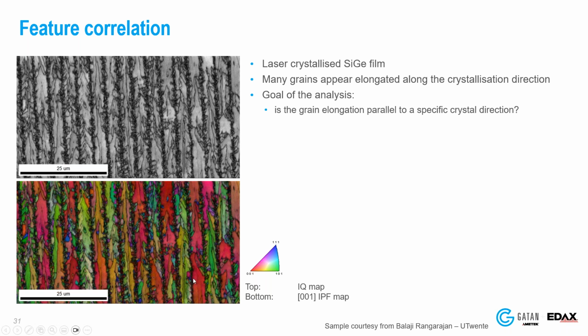Here at the bottom, we have a standard IPF map. That's the lattice plane of the crystals in the sample surface, or the plane normal sticking out towards us. So red would be 001, blue 111, and green 101. So it's a little bit of everything here. I could rotate that viewing axis and look at it from the top, but those planes are slightly oblique.